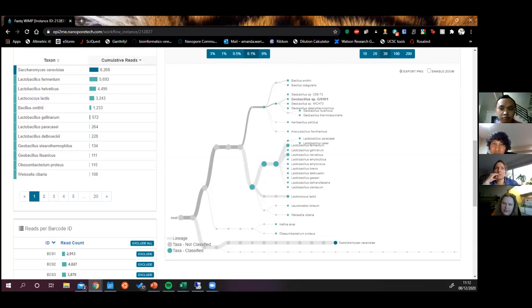I haven't tried it. You could try it. I'm not sure if it would just end up confusing, to be honest. Particularly your abundance profiles would be confusing. I think I would preferably keep it separate. Again, if you did the sequencing once without doing the analysis in real time, and then tried the analysis on both different ones and then decided which one works best, I think that would probably be better than trying to do everything at once.